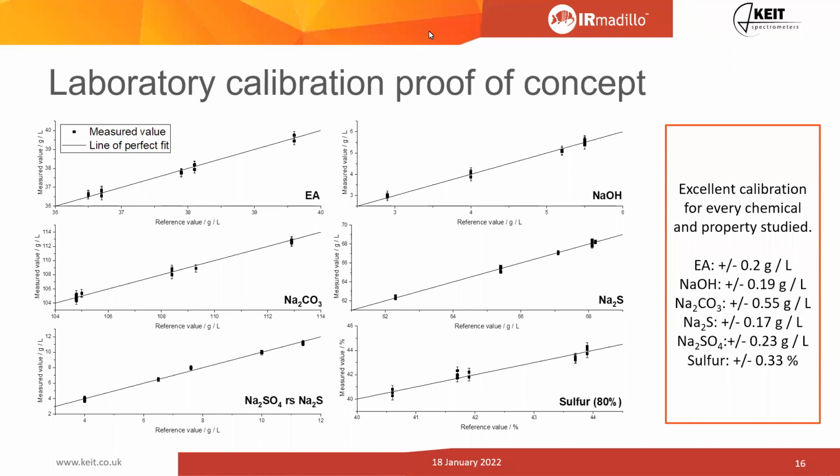Alrighty, and what about scaling up of the probe? Yes, if the probe window were to be completely covered in scale, that is potentially a problem. The way that the ATR works is it needs to see the liquid. Very recently, we had a customer who was reporting that it took a long time for their sample to stabilize. They would flush out their line, and then it would take upwards of an hour before it would actually completely stabilize, which doesn't make sense. It should be within seconds.